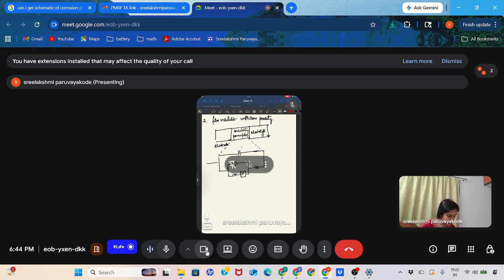And this part becomes this because of the film. Because once it's in the electrolyte, then after that, this part where the electrode and electrolyte are, can be described using the double layer capacitance, and you have CDL, RCT, and this the Warburg.